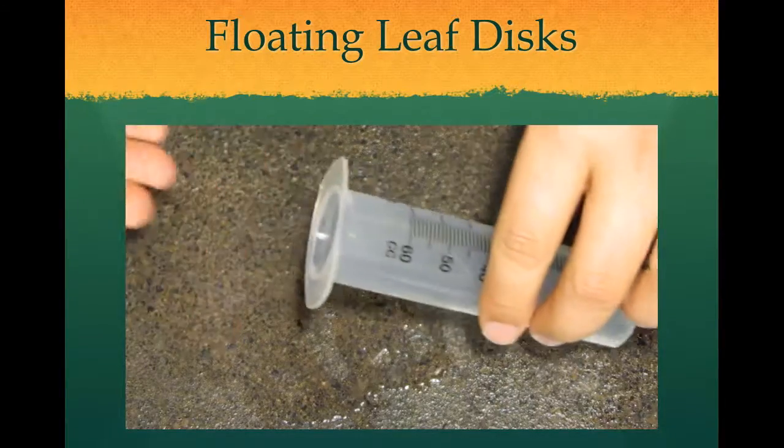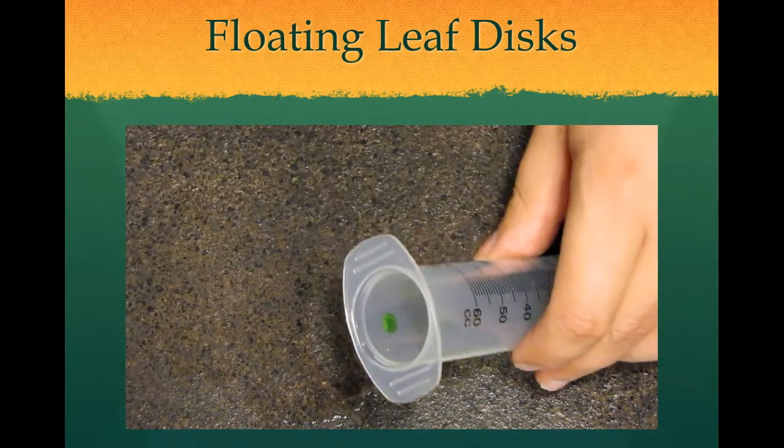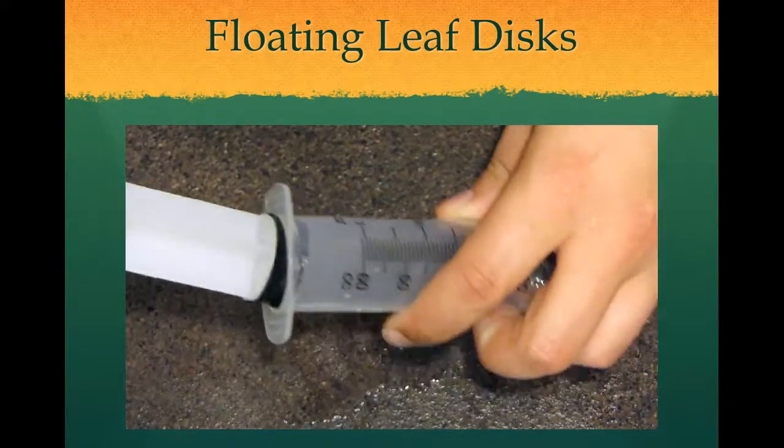Remove the plunger from the barrel of the syringe and place the discs into the syringe barrel. Replace the plunger.